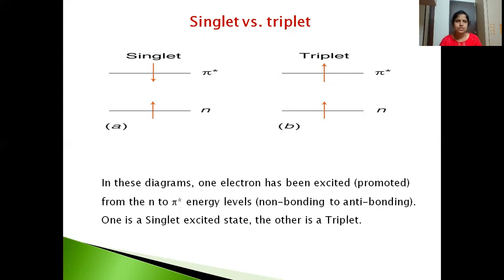So till now we have seen the introduction of spectroscopy, that is all the terms which are involved in spectroscopy, and we have seen the principle behind UV visible. So what is happening in UV visible? When the UV visible light is irradiated onto the sample, what changes do we observe in the molecule? The excitation between the electronic energy levels is seen. That is the reason the UV visible spectroscopy is also called electronic band spectroscopy.